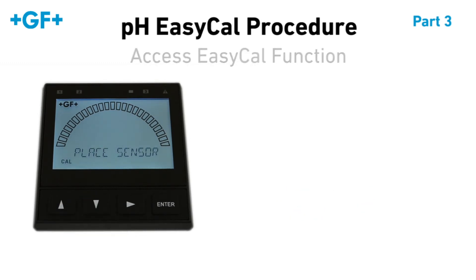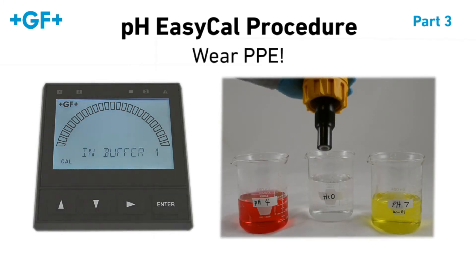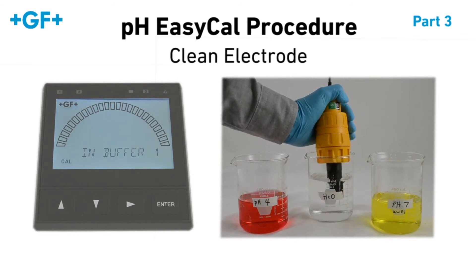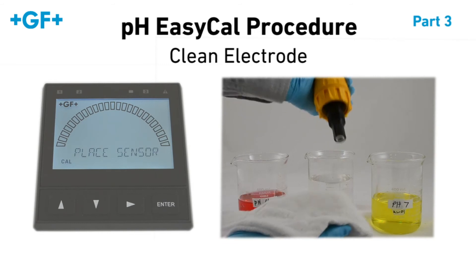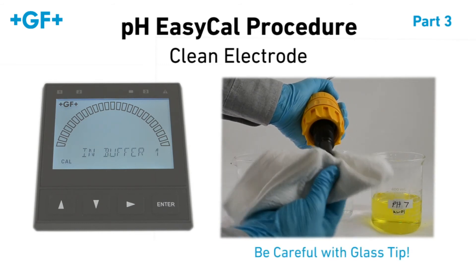Place sensor in buffer 1 will flash on the display. Before moving forward, put on your protective gloves, and we need to clean the electrode. Rinse the electrode in the container of clean water and pat dry with the non-abrasive cloth, being careful not to scratch the glass tip.